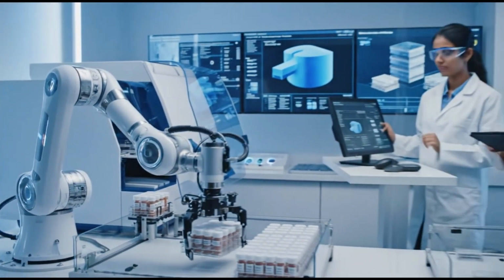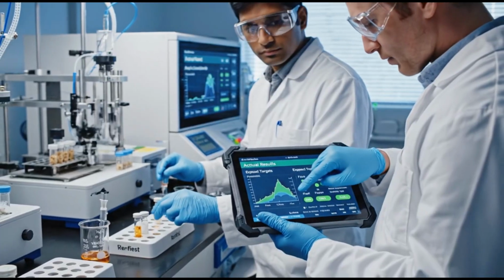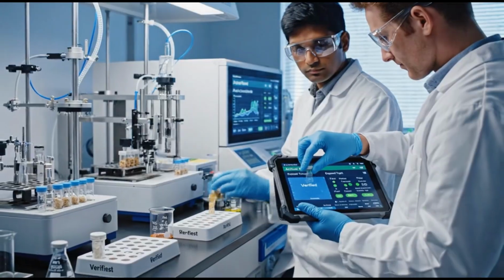Automated sample handling reduces human contact. Robots transfer tissues between testing modules. The automated reading is holding steady at 25 grams. Confirmed. The manual titration matches the target. Now this sample requires re-verification.